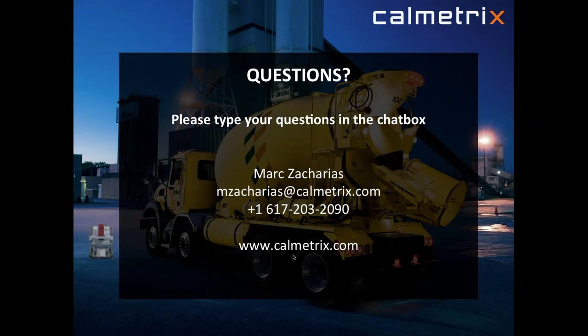And so you can take this to the field. It is pretty heavy, so you have to transport it there, of course. But the way it's done, you put it in a tent, leave it there, and you need a little base for it. It works very well. Of course, you need electrical supply, but it works very well in the field. It can stay there for extended periods of time. I don't want to say it's very practical moving it because it's so heavy, but it's not complicated to take apart and put back together. There's no complicated calibration either because it self-calibrates. So you just set it up and make sure it's protected from the elements as much as you can.